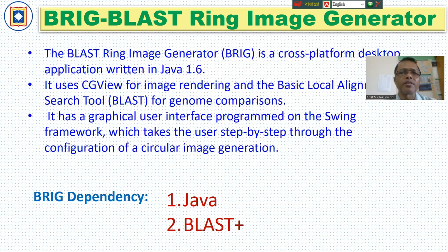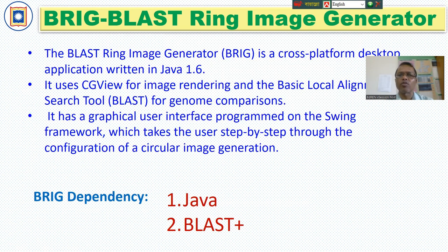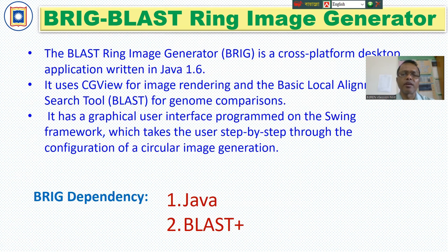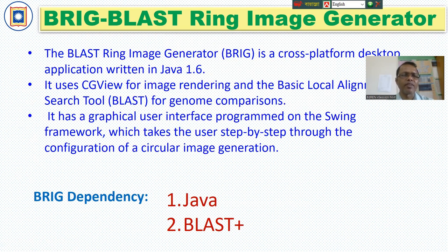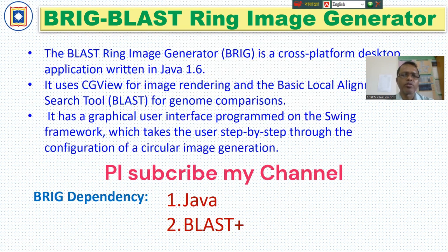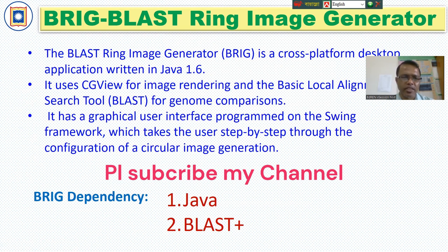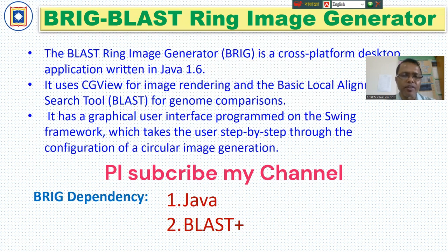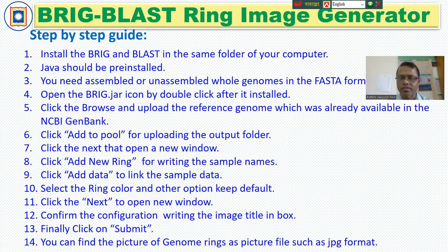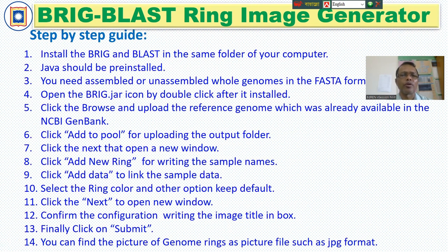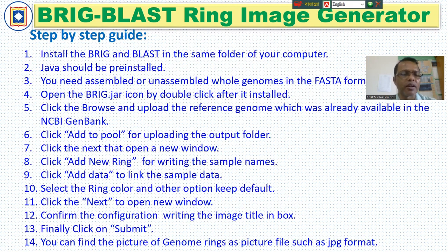This is BRIG Blast Ring Image Generator. The Blast Ring Image Generator is a cross-platform desktop application written in Java 1.6 and it uses CGView for image rendering and the basic local alignment search tools, Blast, for genome comparisons. It has graphical user interface program on the swing framework, which takes the user step-by-step through the configuration of circular image generation. BRIG dependency usually depends on the Java and Blast Plus. Let's see how to use BRIG. It is the step-by-step guideline I will show you here.